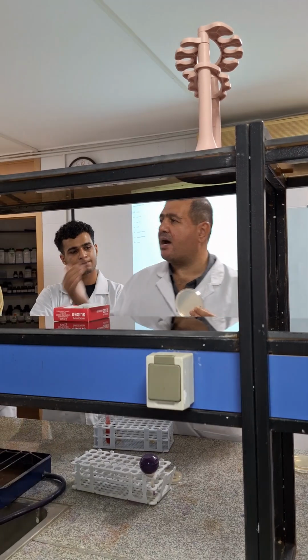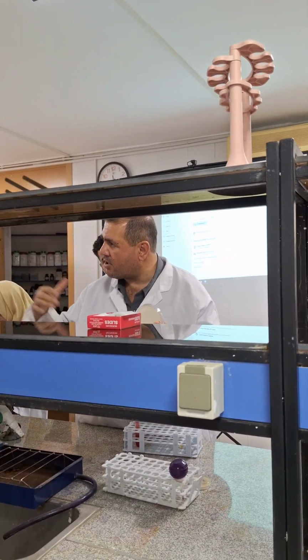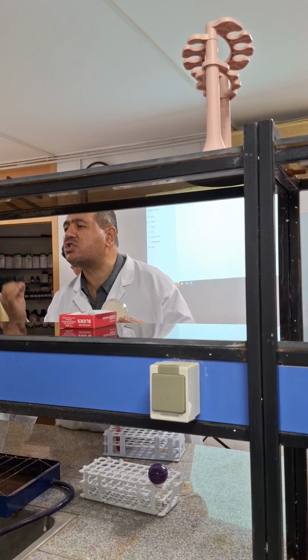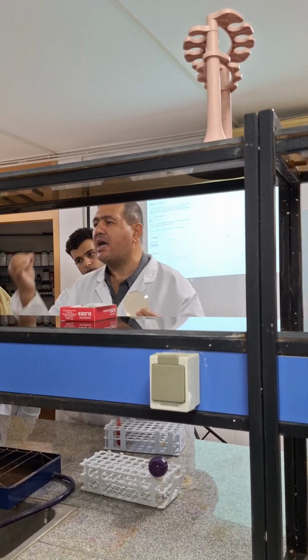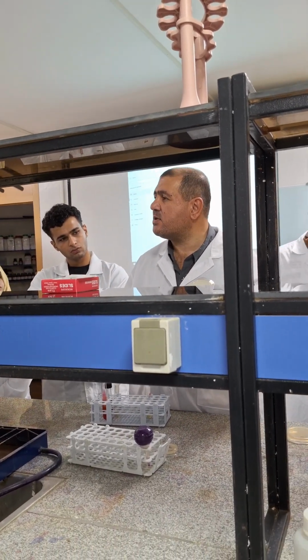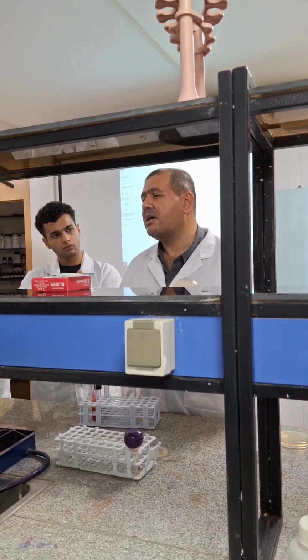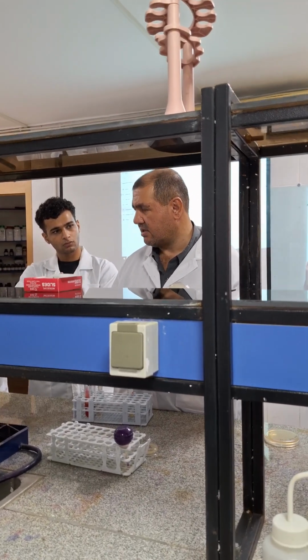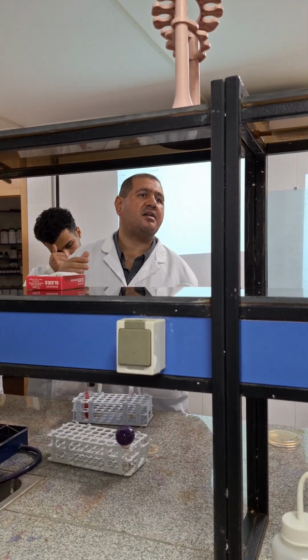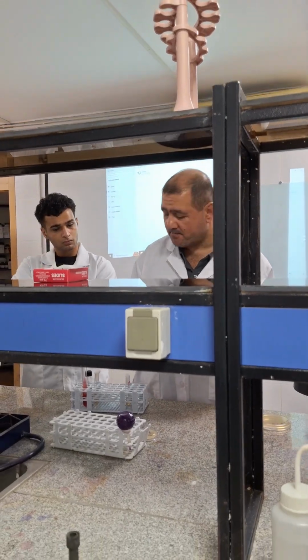Basic media plus growth factors, for example, serum, amino acids, blood, change your media into enriched media. Enriched media such as chocolate agar, blood agar, are used to culture fastidious bacteria, for example, Streptococcus pneumoniae, Neisseria meningitidis. These bacteria are fastidious bacteria and need enriched media for growing.